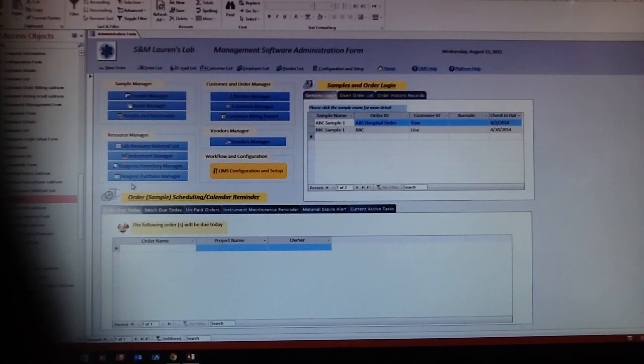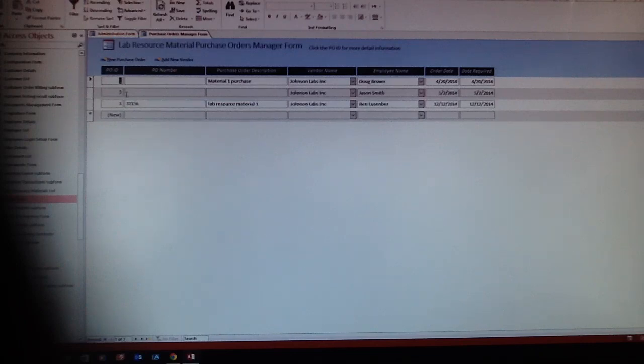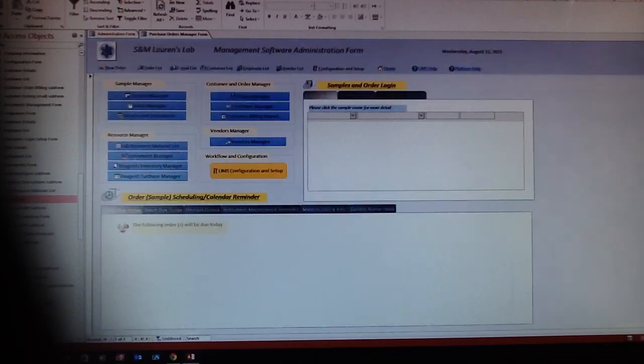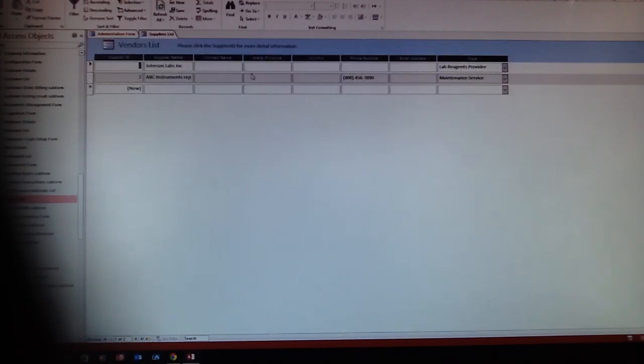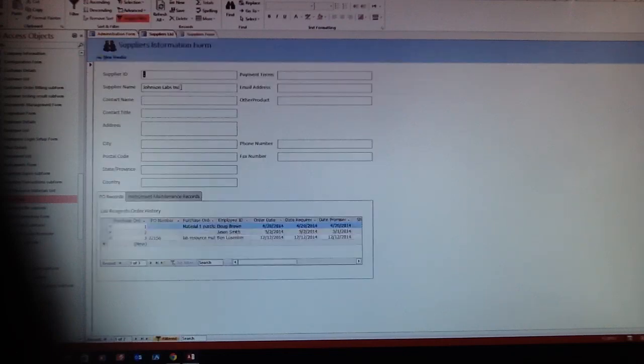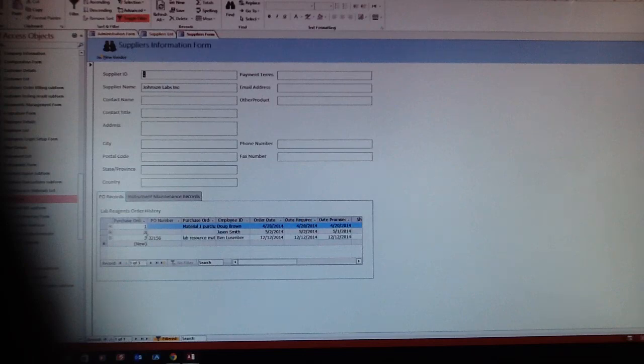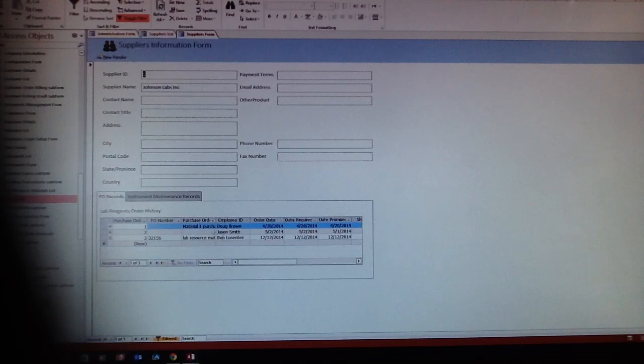Here is the purchase order. It records what kind of material you are going to buy and which vendors you are using. Here are the materials or maintenance of vendor information. You simply click on that and it will show the vendor's information, contact information, and the purchase order you made.